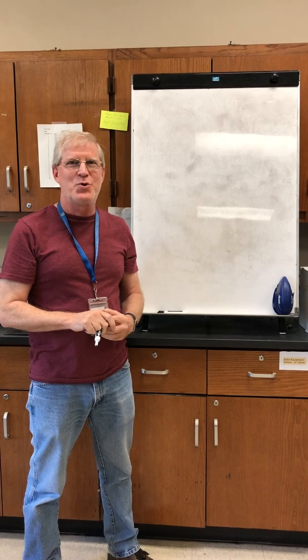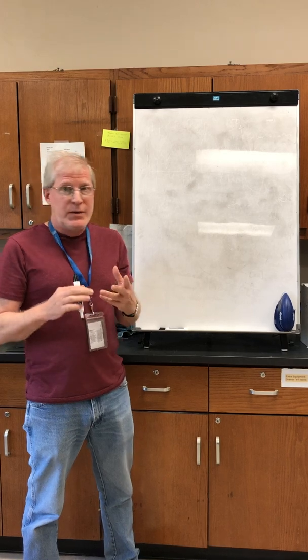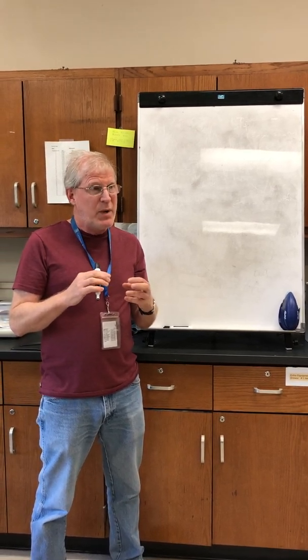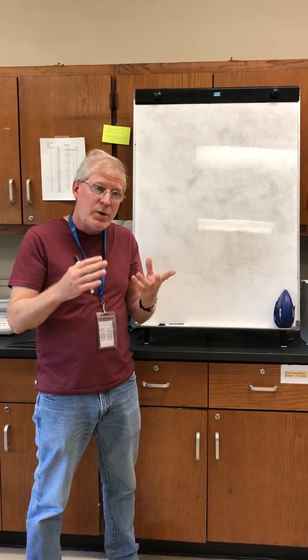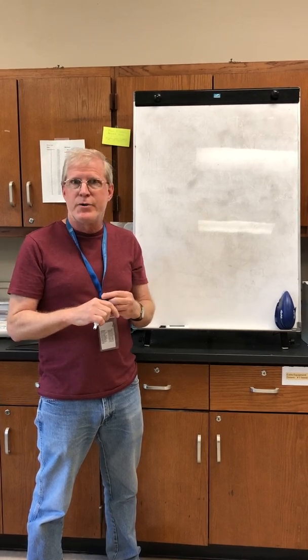Welcome to our second virtual chem lab here at LSMSA. So we've got some equipment set up over here. We're basically going to find the density of some liquids, find the density of some solids. And so I'm just going to introduce a little bit about density. I know you've talked about this in class already, but we're just going to review it a little bit, talk about some of the measurements, and talk about percent error calculations.